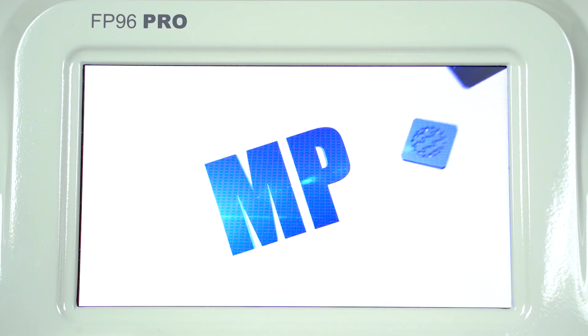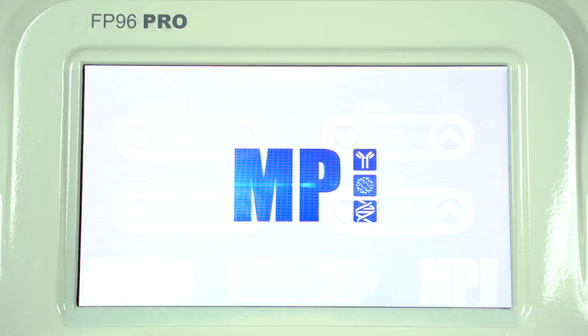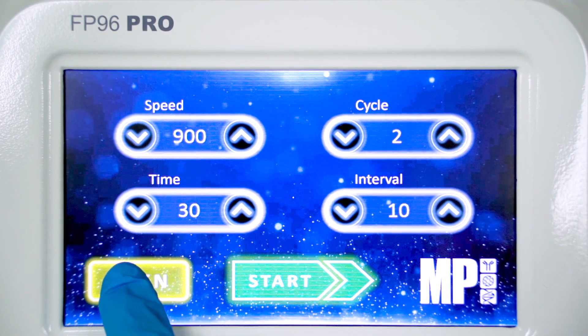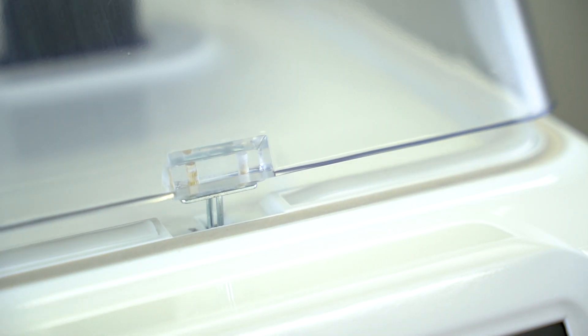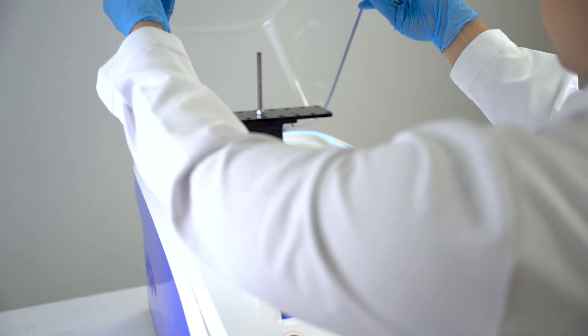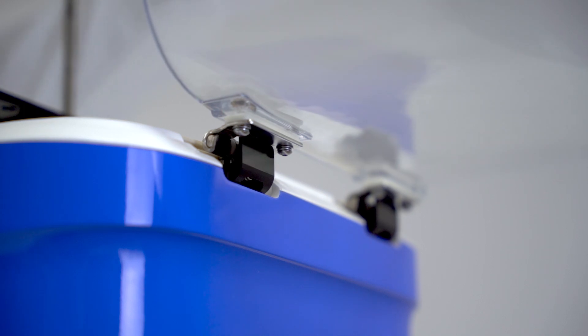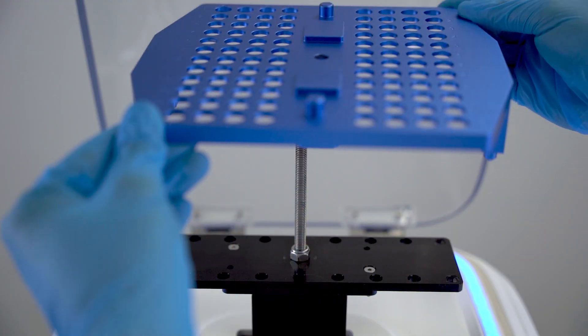Now it's time to install the adapter. Press open on the screen to unlock the dome and push it upwards to open up to a maximum of 90 degrees. Align the machine's rod with the center of the adapter and slide it into place securely.